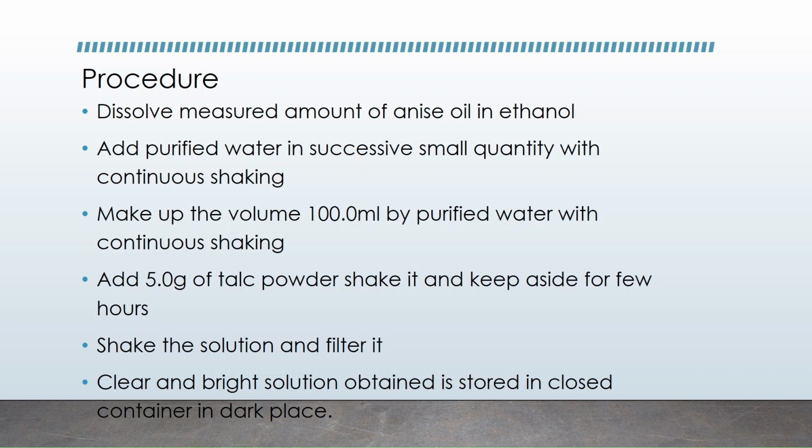Like you top up to the volume, because the required volume we need here is 100 mils. So I think we're wondering, where have we put talc? Why is talc not coming? We are already topping up to the volume of 100.0 mils without including talc. So the next thing we do is we add our 5.0 grams of talc powder, shake it, and then keep aside for a few hours.